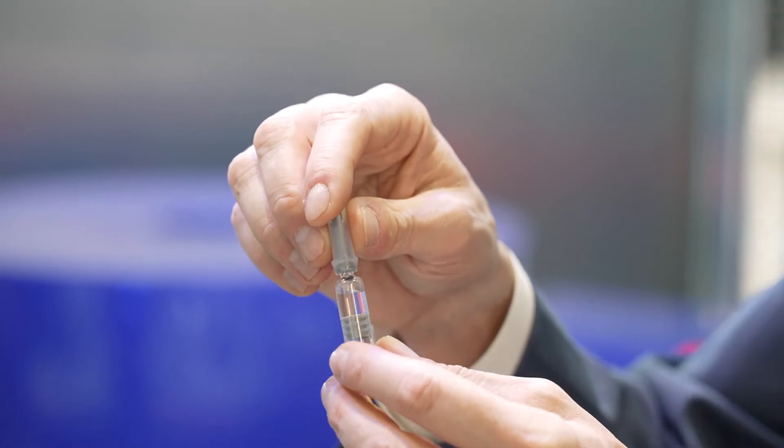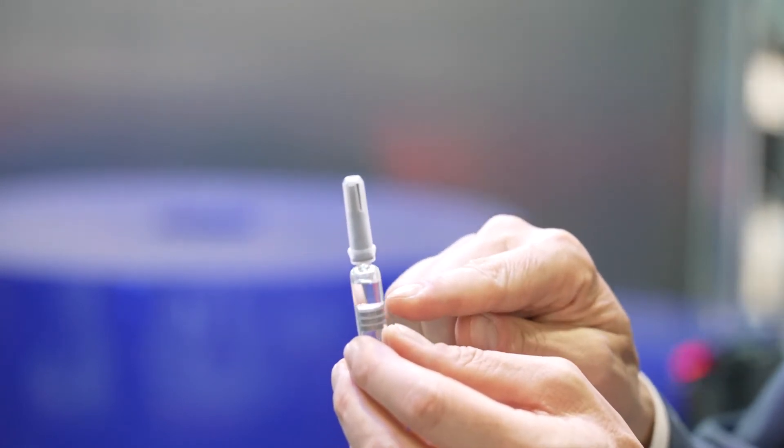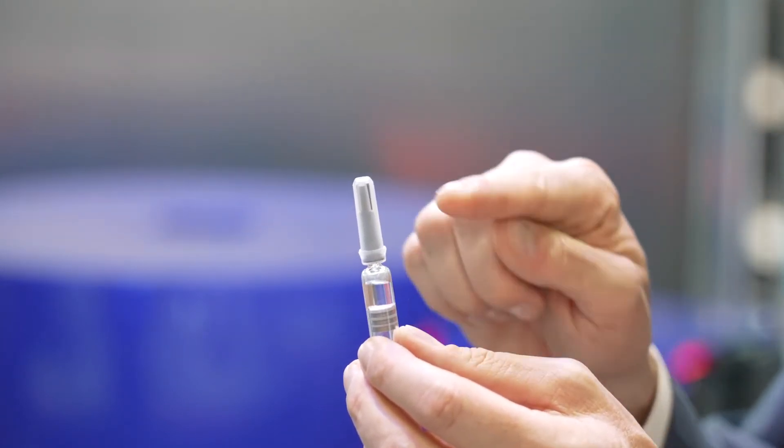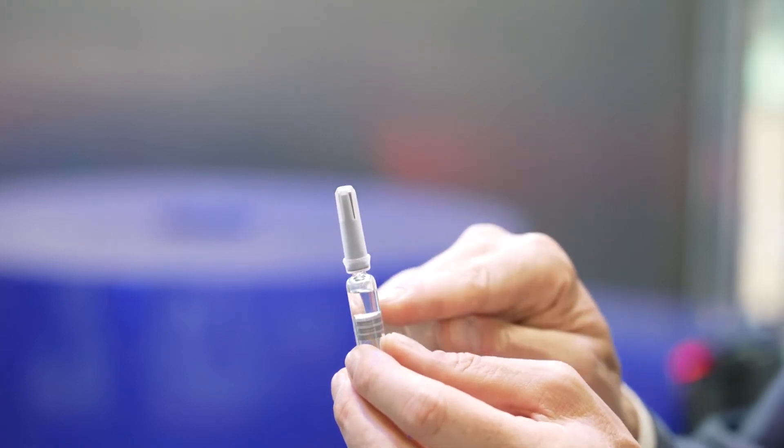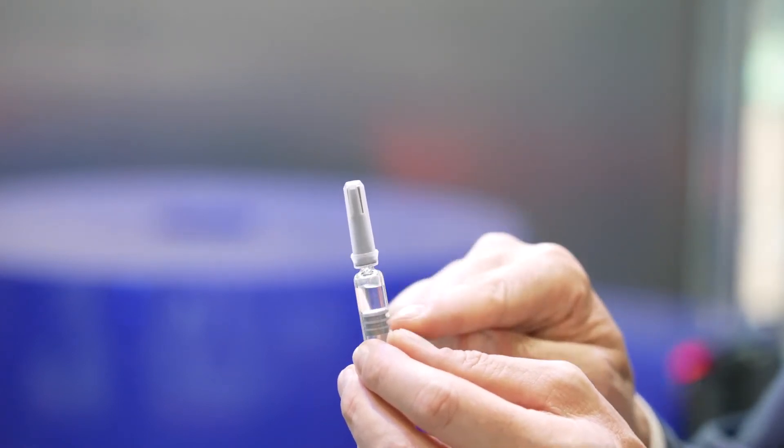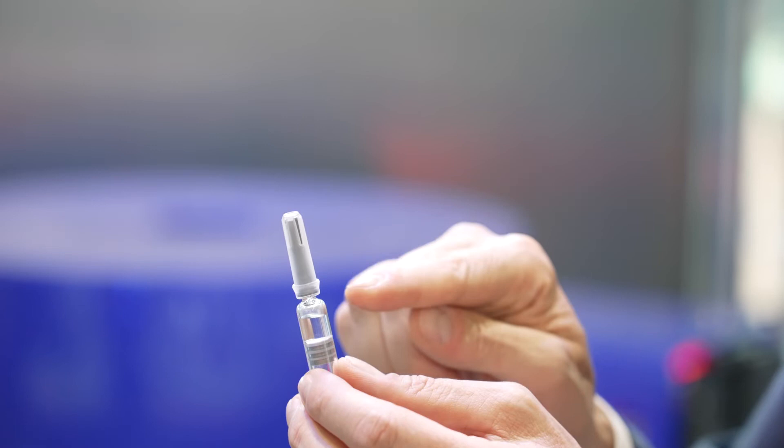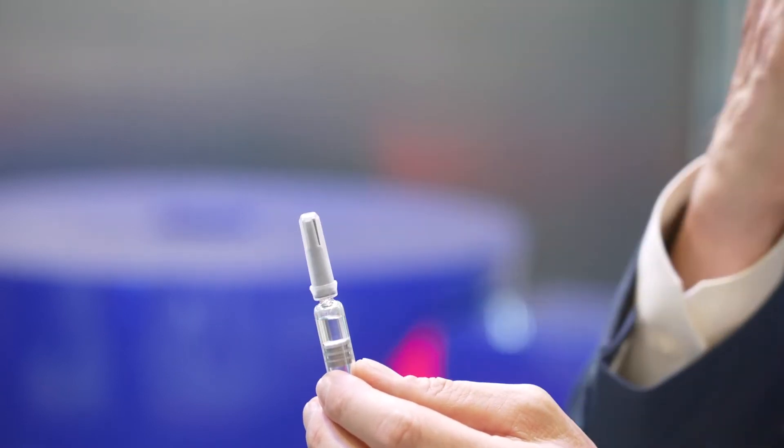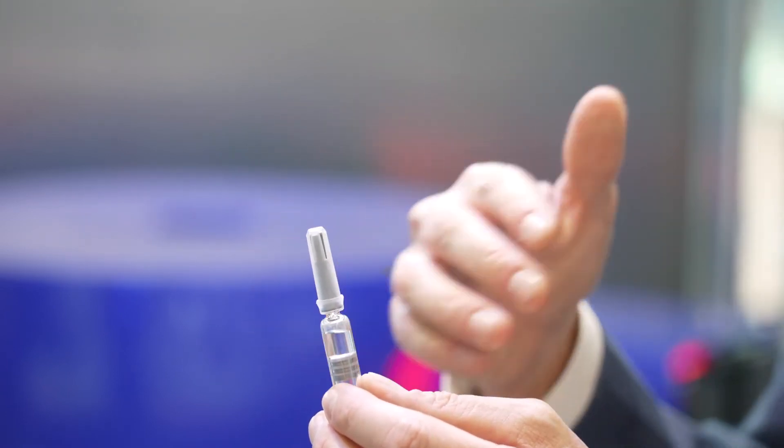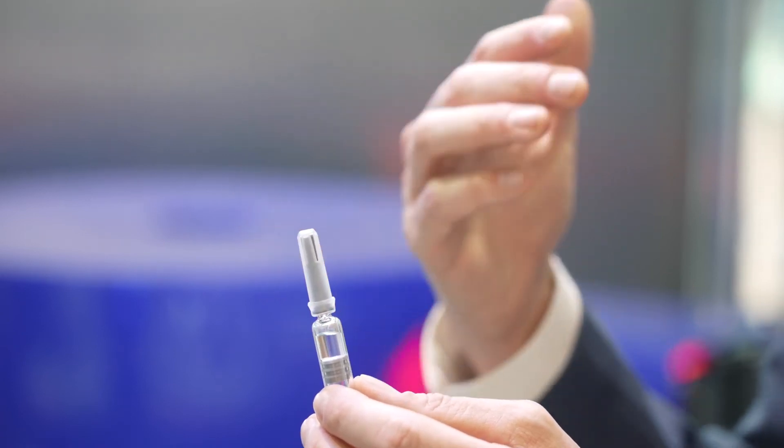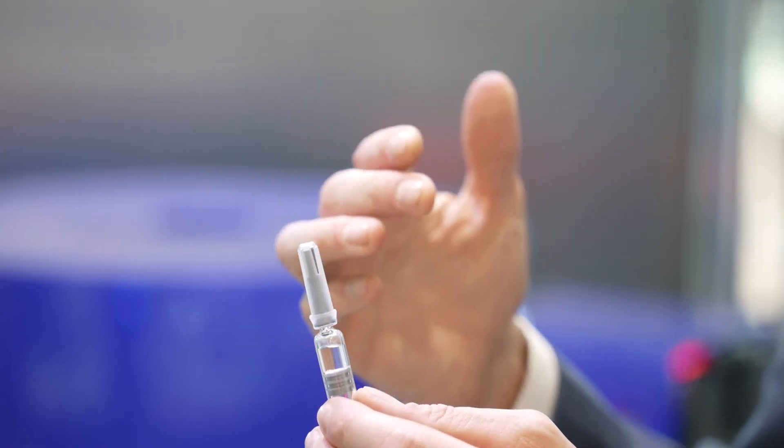Then we have the second particle inspection in the carousel. We have another high spin spinning. We have the second particle inspection for moving particle. In this case, we can use a different light and different set of parameters to maximize the detection of different kinds of particles.